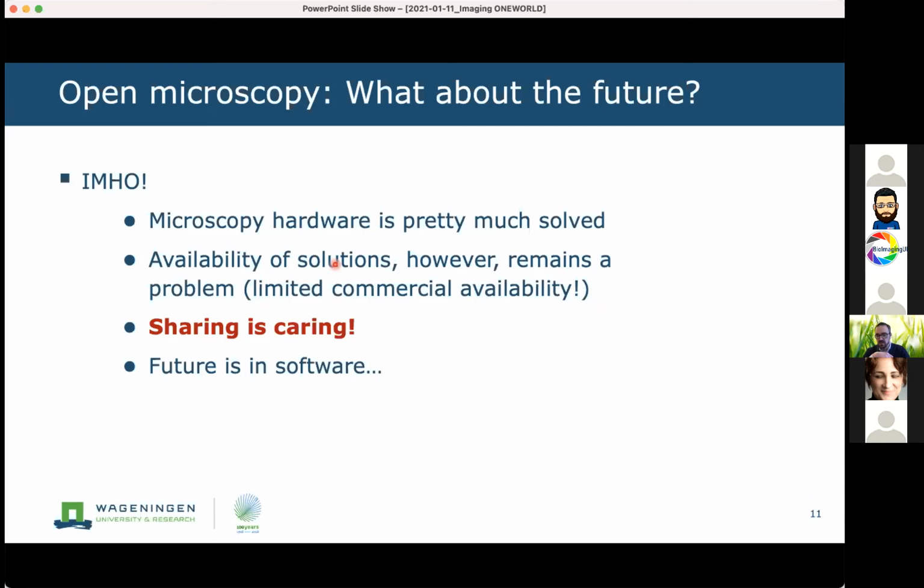So in a way, I think it could make sense if there's more commercially available. I always now start looking at the time. Okay, this is great if I can order everything from Alibaba and it's very cheap and I have a laser diode, but how long does it take you to get it running and how stable will it be for the future? Will it still be stable in half a year's time, or is my laser diode already dead? So, things to consider.